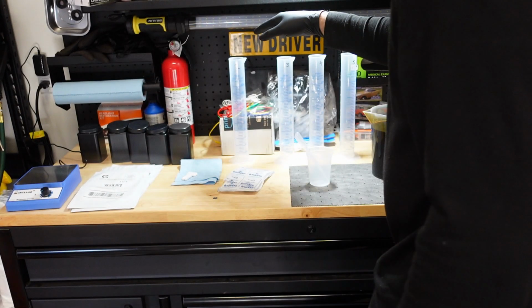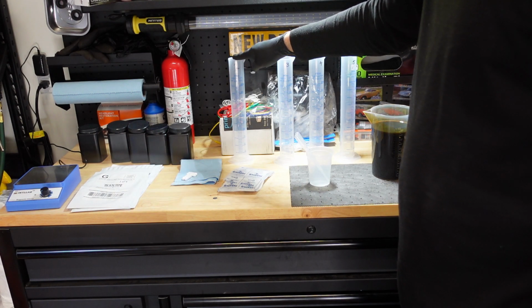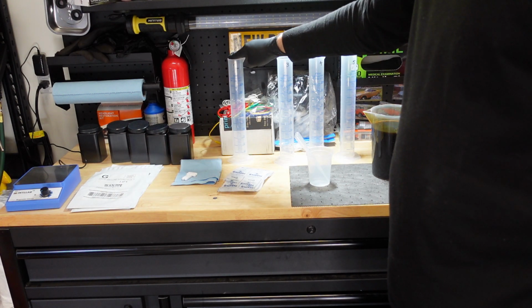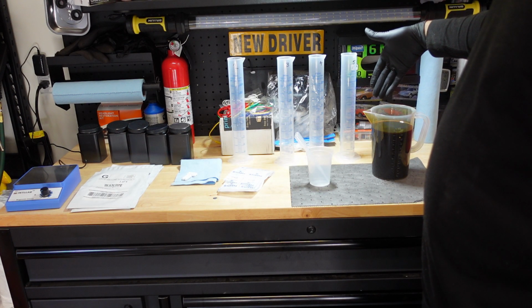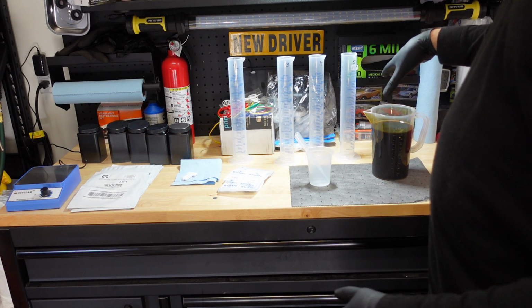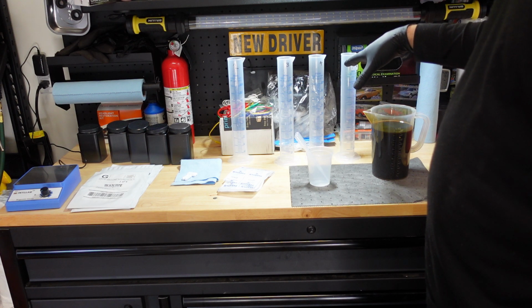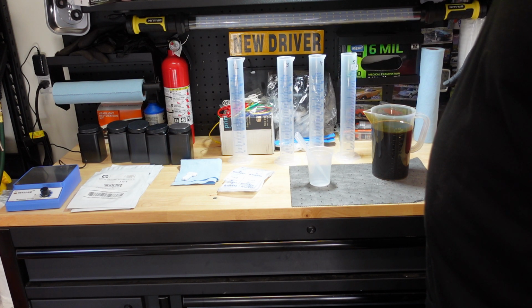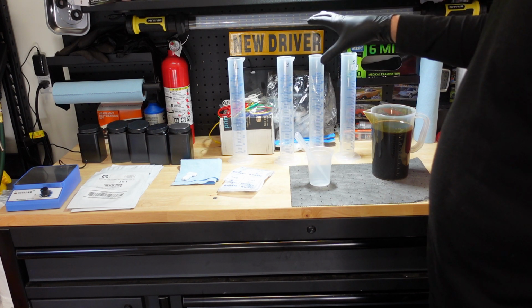All right, for this next sample, I'm going to fill this up to 220 mLs of this used oil. Much more detail about this oil, where it comes from, all of that, will be explained in the second part of the video, along with much more about the gas, but this is just the sample collection part.